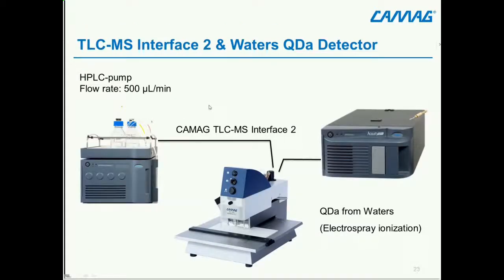After identification by visual inspection, information with HPTLC-MS. What you need is a pump, can be the HPLC pump that might be anyway in the lab infrastructure, and you need a mass spectrometer. Our TLC-MS interface is then the connection between the pump and the mass spectrometer to elute our target of interest from the plate. And this is really an easy step.